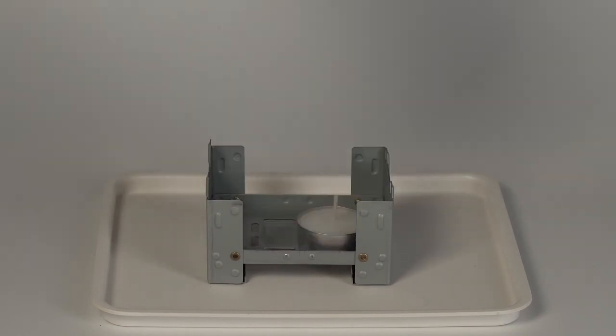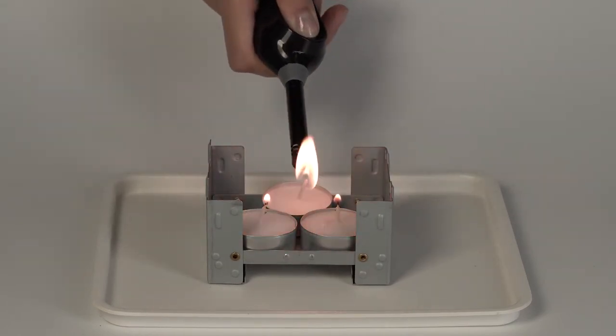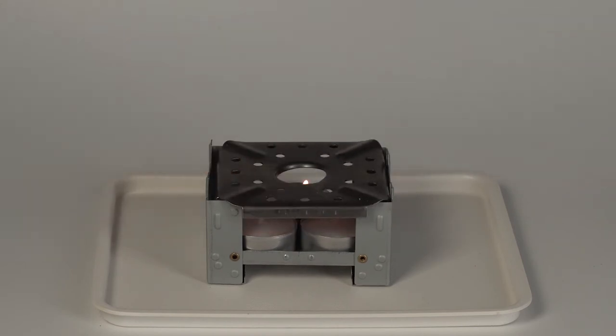Put the stove onto the tray. Set three candles onto the stove and light them. Cover the stove with the flame diffuser and then with the foil.